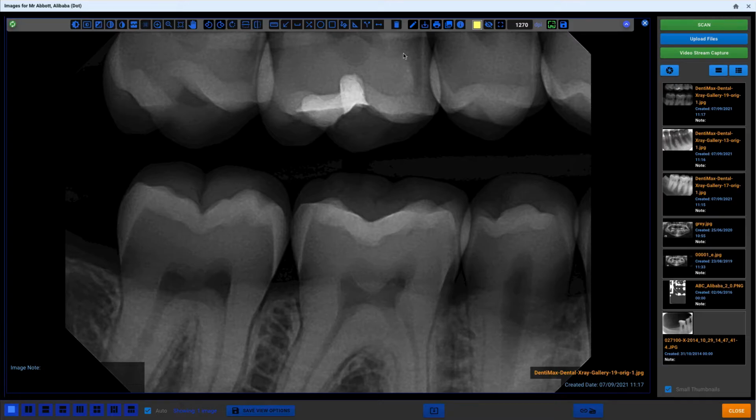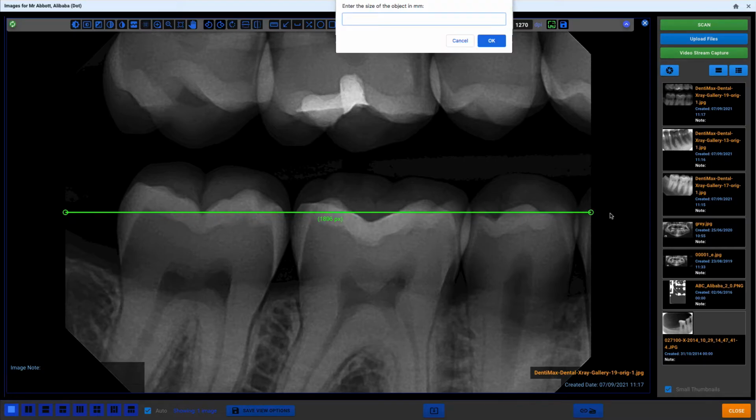Now I will use the second calibration method. I do not know the resolution of the scanner, but I know that my plate size width is 38 mm. I will use the calibration tool and will draw a measurement line from side to side of my scanned image. Please ensure that your image is reset before you do that. The simplest method to do it is to close and reopen the image. The calibration line is always strictly horizontal. It conveniently snaps to the left and right border of the image. I will enter 38 in the pop-up dialog and will press OK.